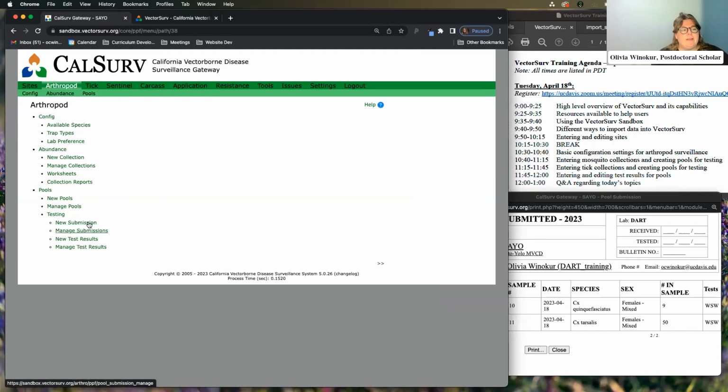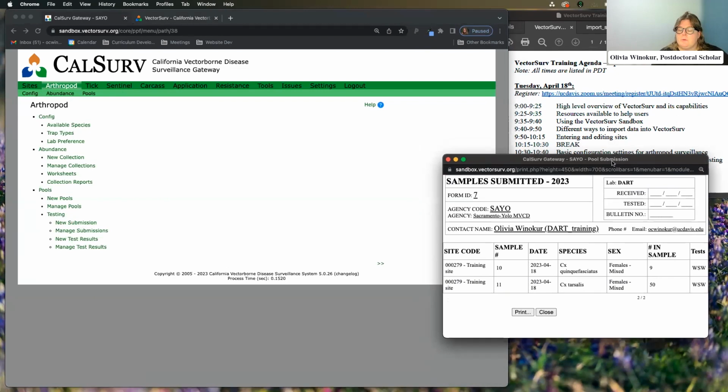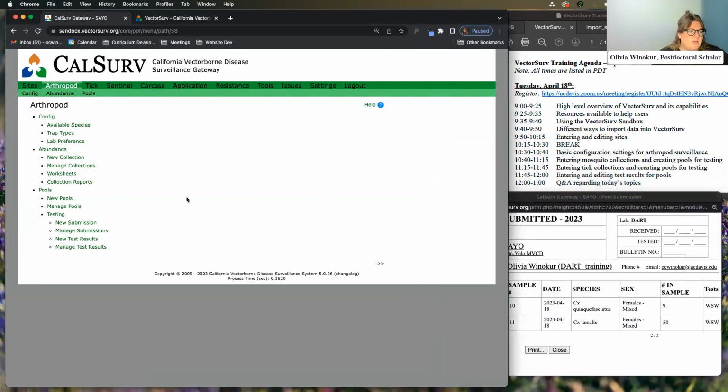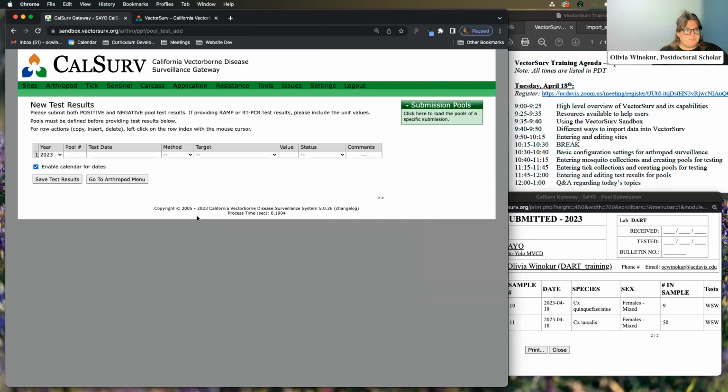Here, we've already created our submissions. And you'll remember that when we wanted to print that form, this is what that looked like from our submissions. We can now add new test results. So we can click that, and in here is where we add our test results.